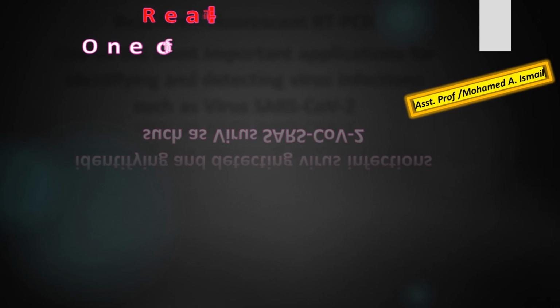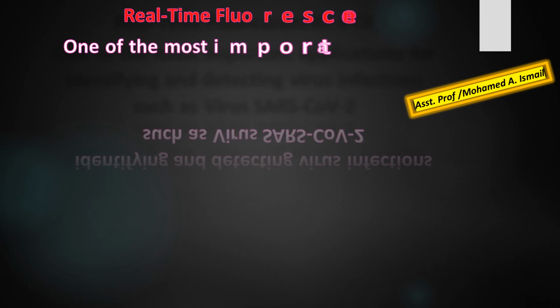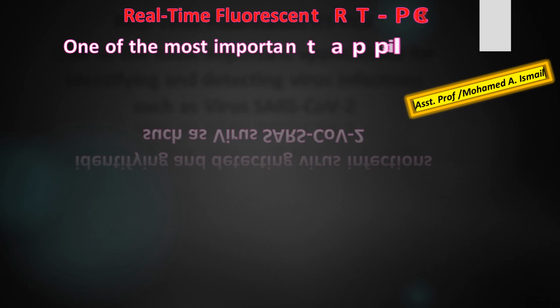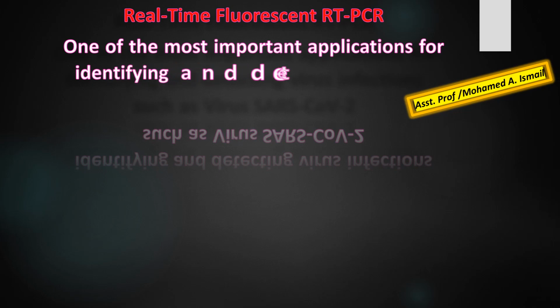Real-time fluorescent reverse transcription polymerase chain reaction. One of the most important applications for identifying and detecting virus infections, such as the virus SARS-CoV-2.